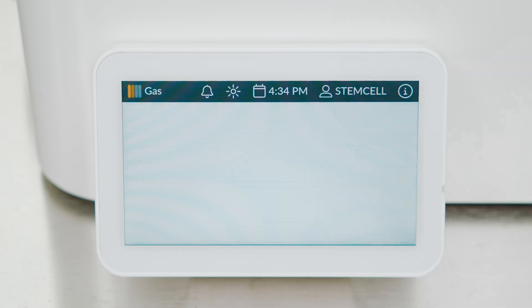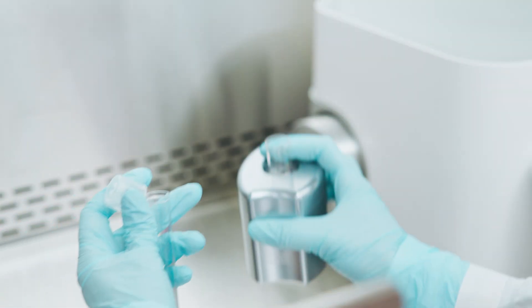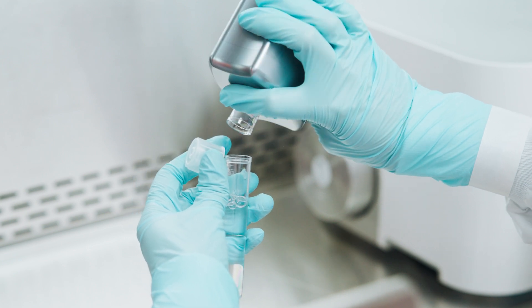In this example experiment, we will run a 5-point pressure sweep for transfecting unactivated T-cells using the recommended 3 seconds of applied pressure per sample. Part 2: Preparing Unactivated T-cells. Standardized cell isolation methods are important considerations for obtaining best results when using the CellPore Transfection System.